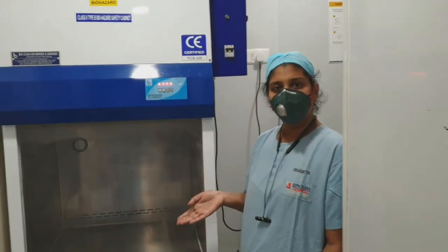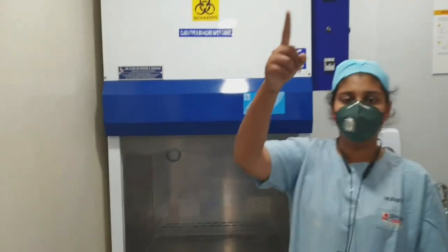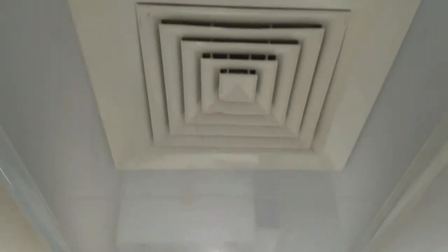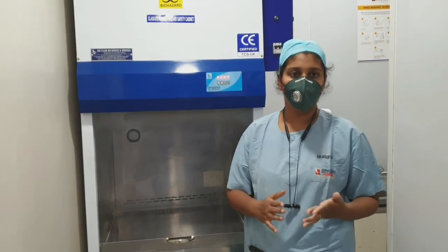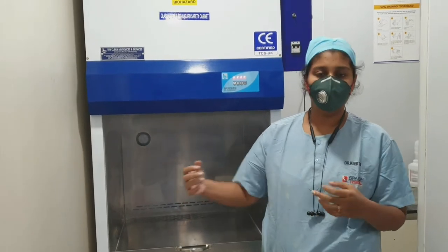Welcome to the chemotherapy room, loading room. This is a HEPA filter. Preferably the room should have a HEPA filter, and the main door of this hood room should always be kept closed at all times and should not be kept open.